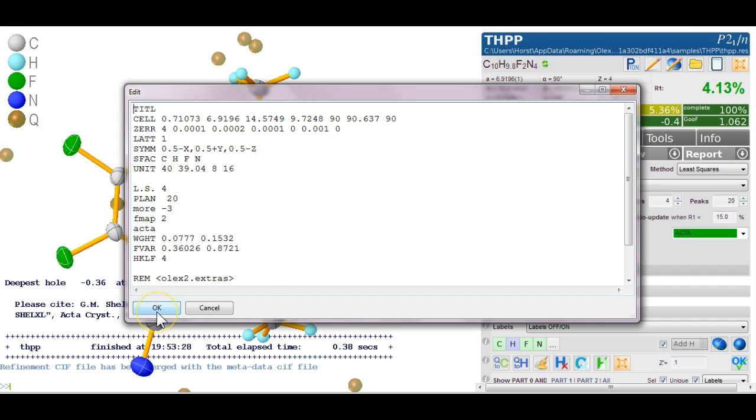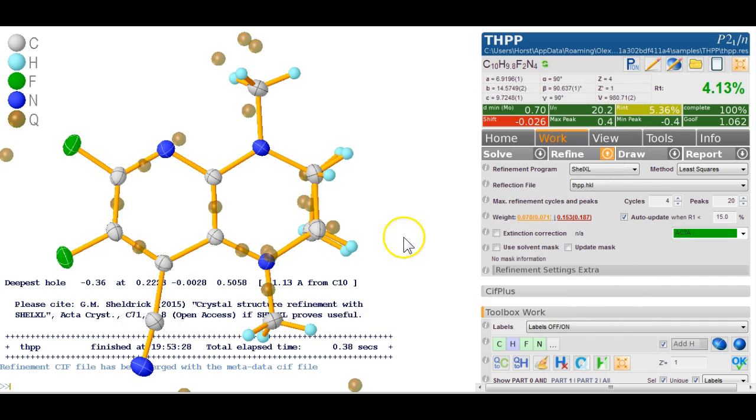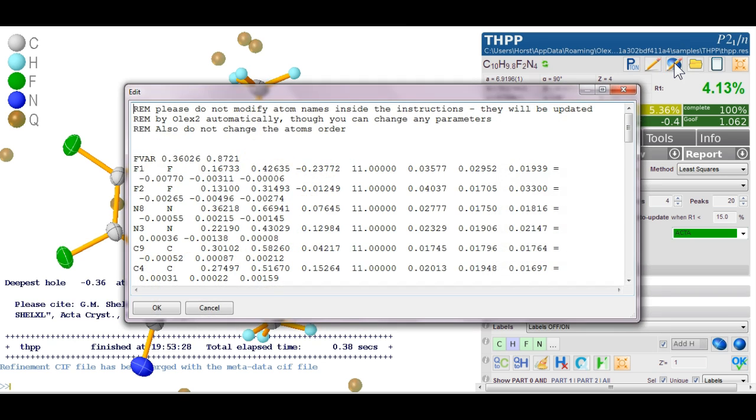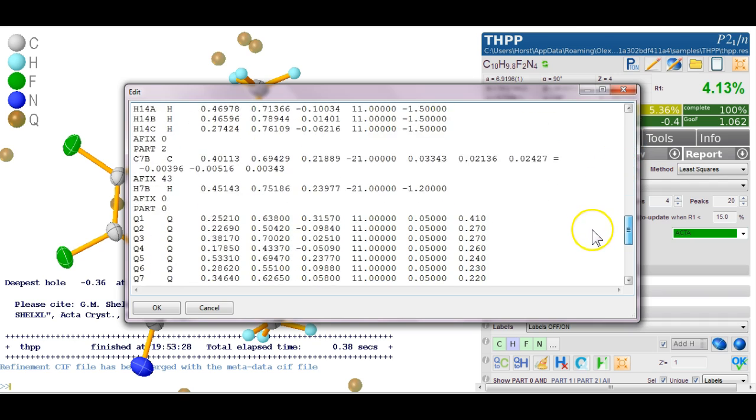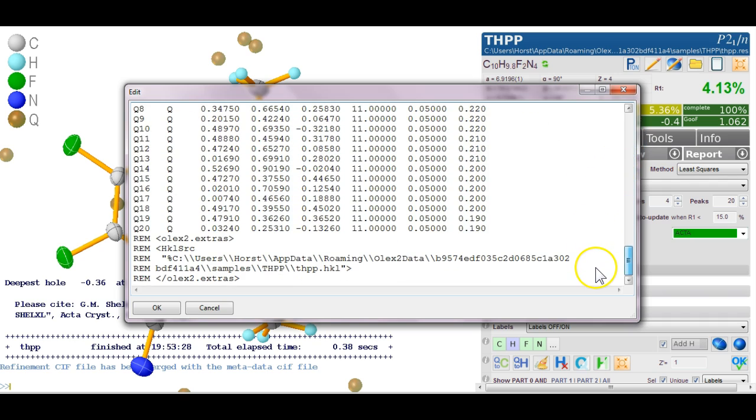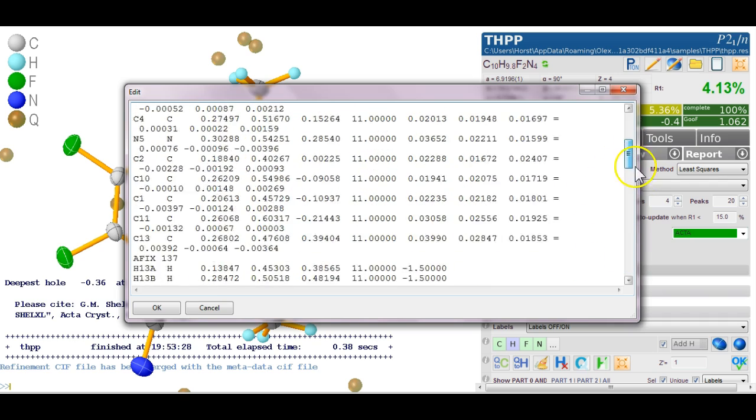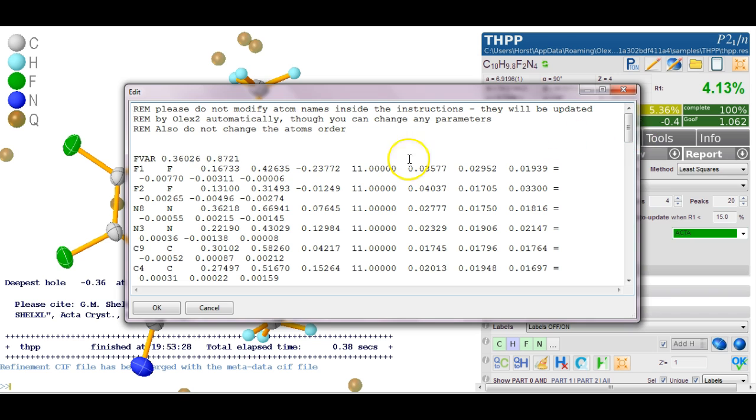Then there is the second button here which is the pen with a sort of atom underneath and this is the list of atoms in your structure and this is just like in an INS file. It's exactly the same except we don't reference a number here but it's actually the atom type symbol that we put in here and then it's clear what it refers to rather than the position in some arbitrary list that is further up.